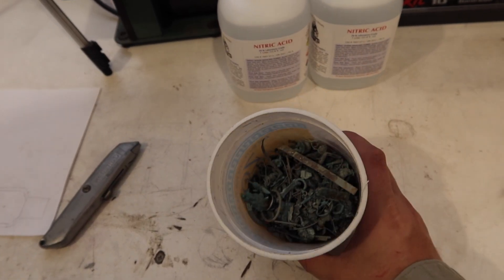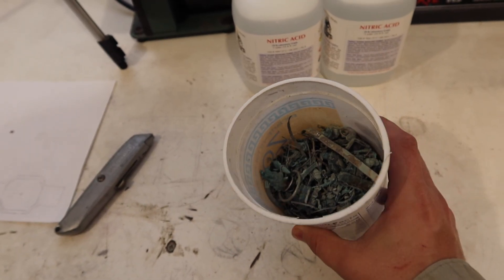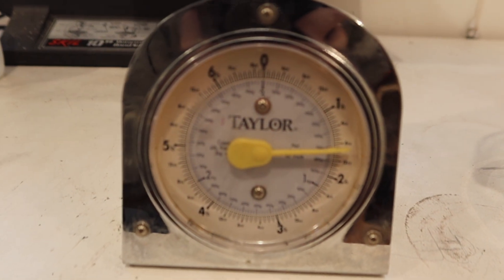Welcome back. Today I've got something a bit different to show you guys. I'm going to refine some scrap sterling silver using 70% nitric acid. The silver I'm going to be using — I tried refining before but I didn't have enough acid, so it's left over from that run and it weighs right around a pound and a half.